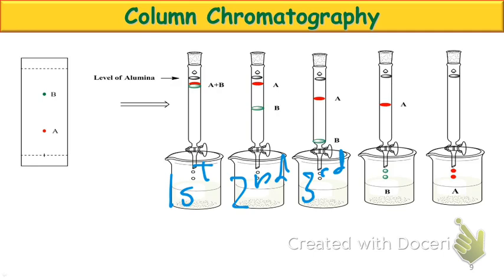What should I do in case B? Or not case B, that fourth case. What's special about that beaker more so than the first three? It definitely does contain compound B, that's true. There's something else that's special about that beaker. What was our goal in this experiment? Purify compounds, separate them away from each other. So we were trying to separate A from B. Okay? Did we add anything to do this?